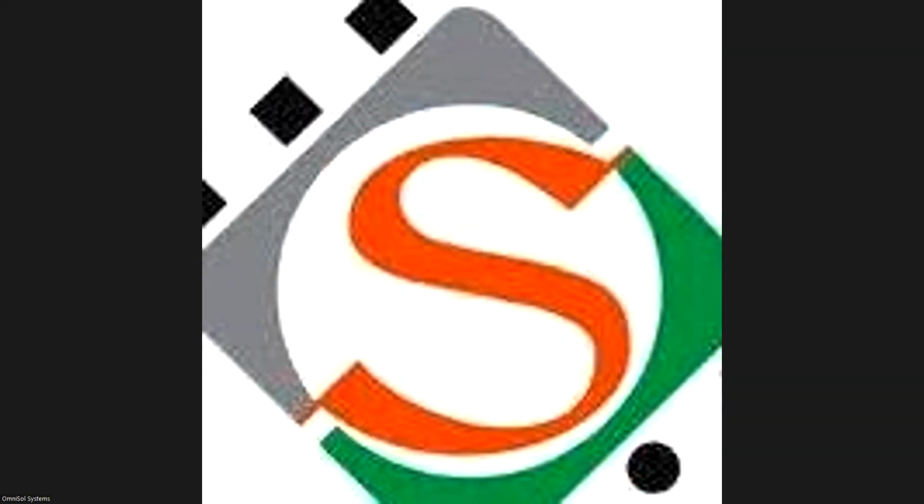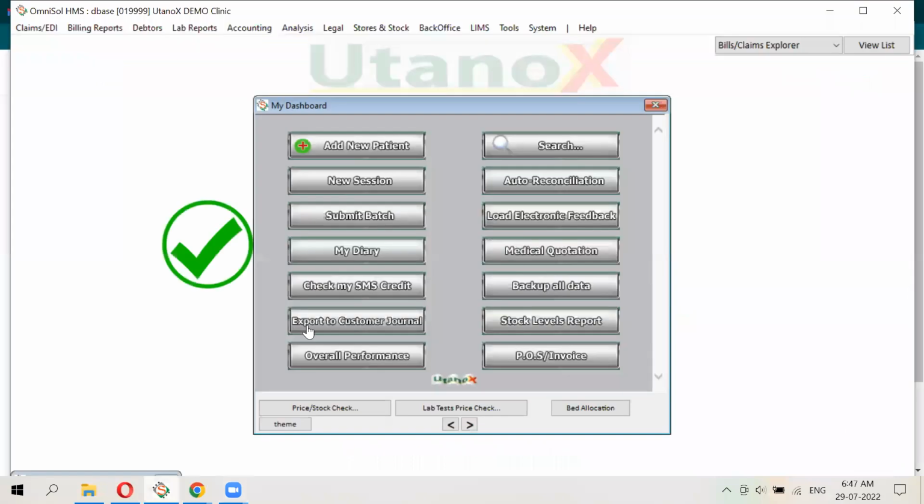Okay, great. I'm going to be walking you through our laboratory information system, and I'll try to be fairly fast in going over it. All right, so allow me to just start the application. So I have the application on the screen. Can you see it? Yes, I can see it.